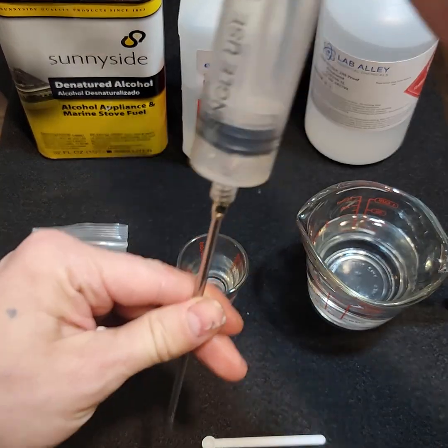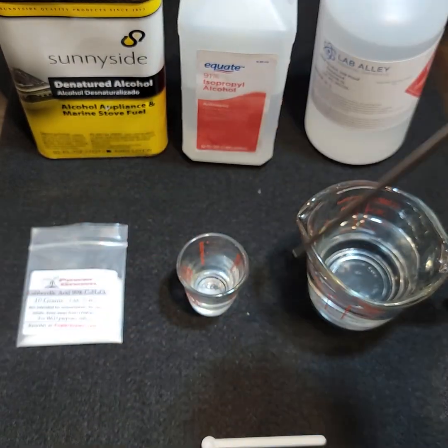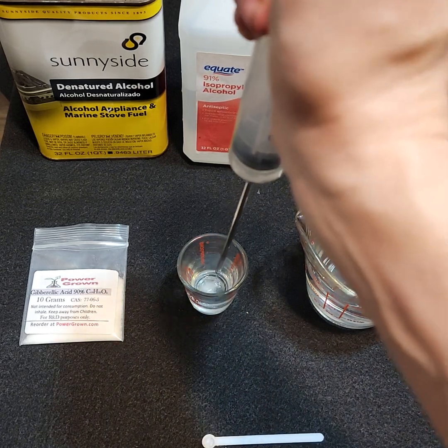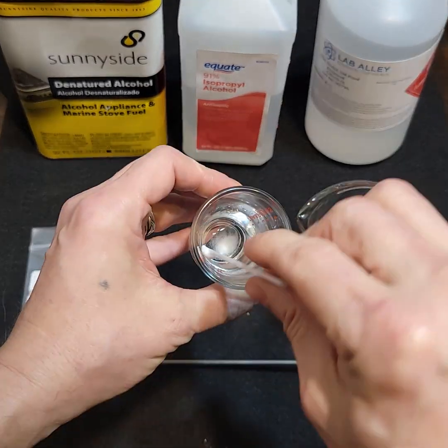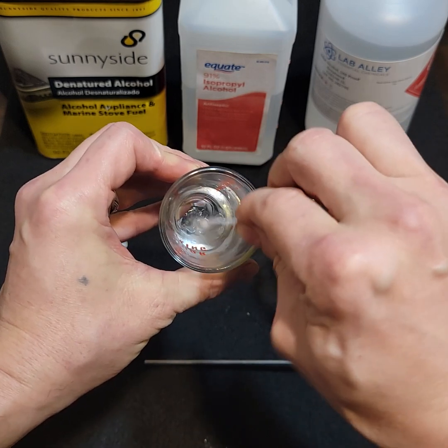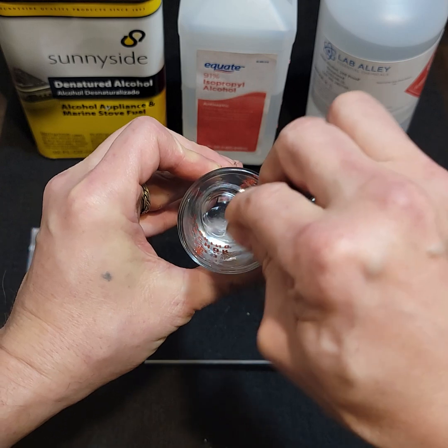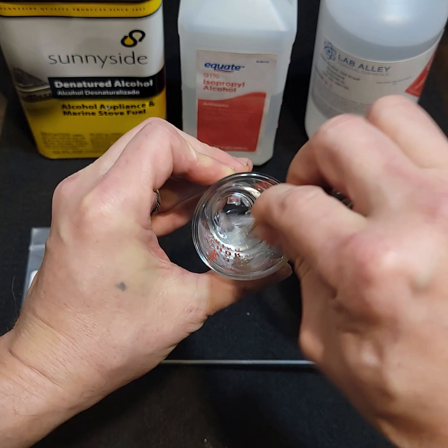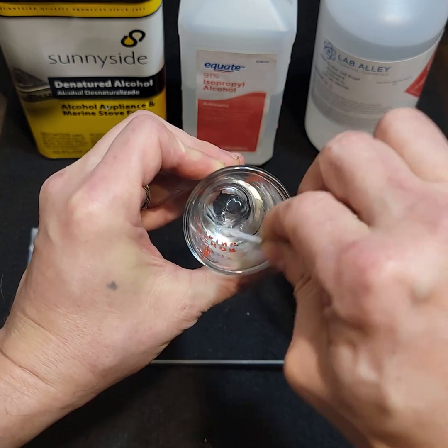I'm going to use about two milliliters of the ethanol — I've already got that in my syringe. Just give it a light stirring. You can see it dissolving. You could probably use less alcohol; I recommend experimenting to find out the lowest amount you can use.